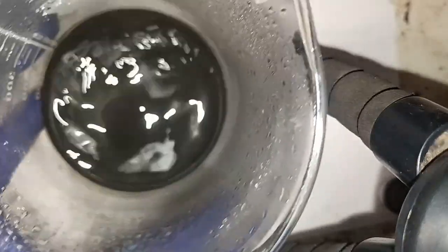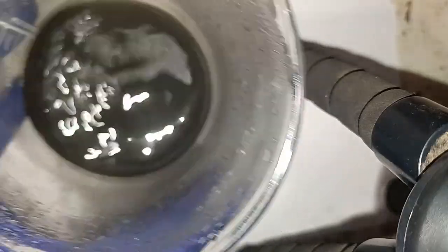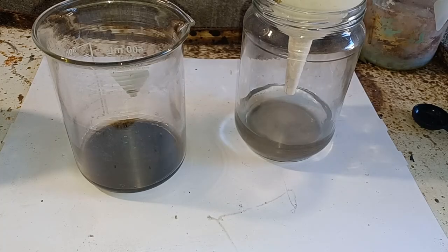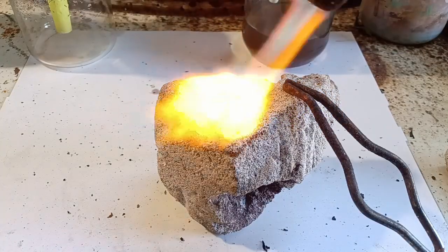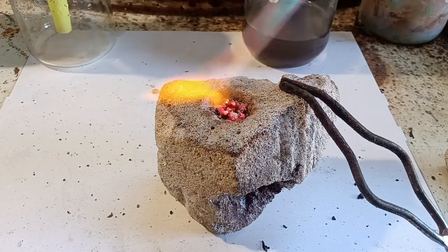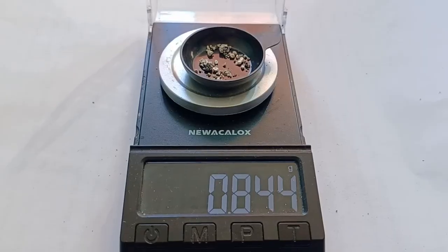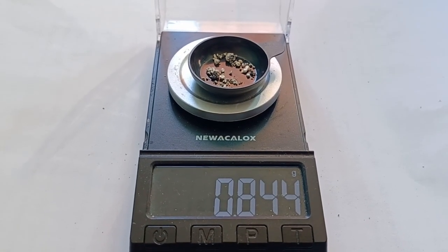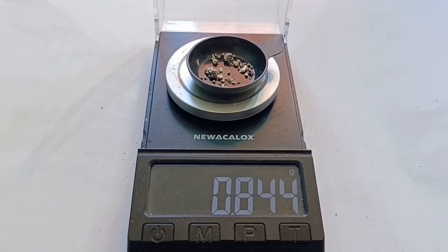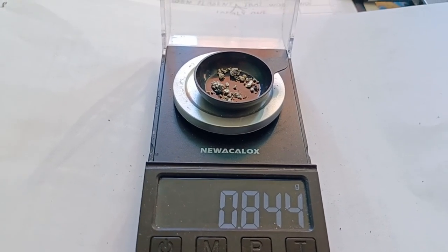It is rather pleasant, which is quite a rarity, at least for me when I'm doing chemistry. After the end of the reaction, I filtered and melted down the powder. The lye and sugar method yielded me 0.84 grams of silver. This is 92% of the theoretical mass.